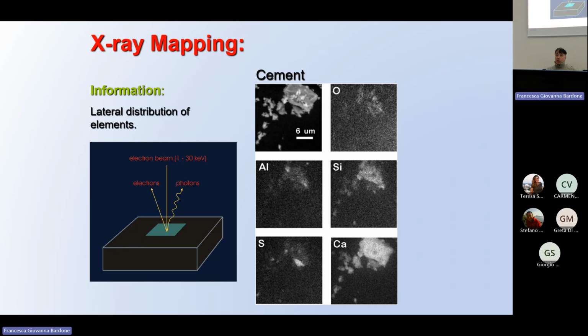But it's easy to do, it's not complicated. Just acquire standards and calibrate your system. And remember, the same accelerating voltage, the same probe, the same condition. You cannot change the voltage of the microscope. If not, the intensity changes because you have changed the voltage of the microscope. So when we do calibration with standards, and you know that mineralogists and people coming from geology ask for quantitative analysis of their rocks, we need to check down to the fraction of a percent, and everything is completely checked and stabilized in the same condition.